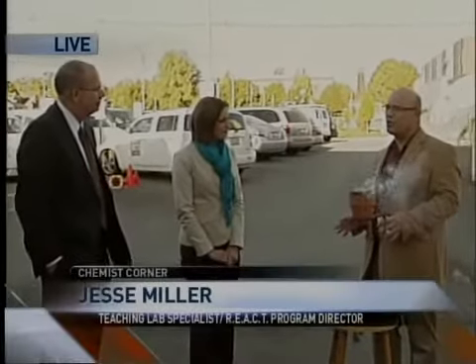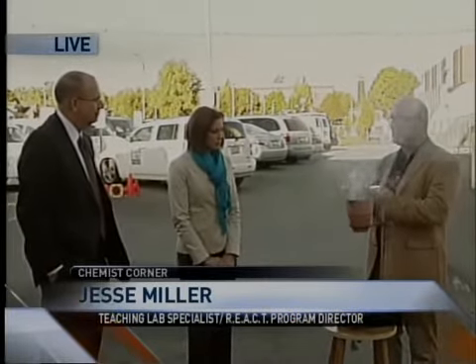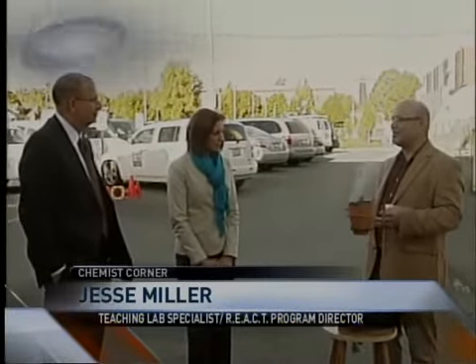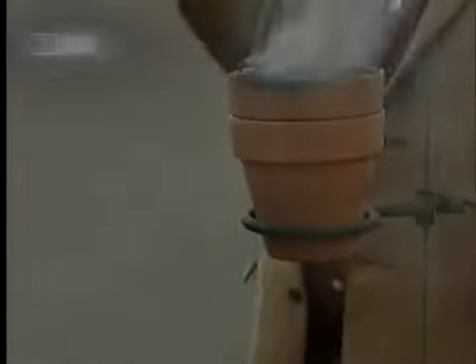It's not that fast, right? Explosions happen much faster. If we were to contain these, they used to use this in World War II, maybe World War I. I'm not really sure. Thermite bombs, okay, and that's basically what was in it. Now, once you contain it, and the gases don't have any place to go, it can become explosive. By doing it out in the open here, we just got a lot of flame and a lot of energy being given off, but it wasn't contained, so we're not worried about it exploding.